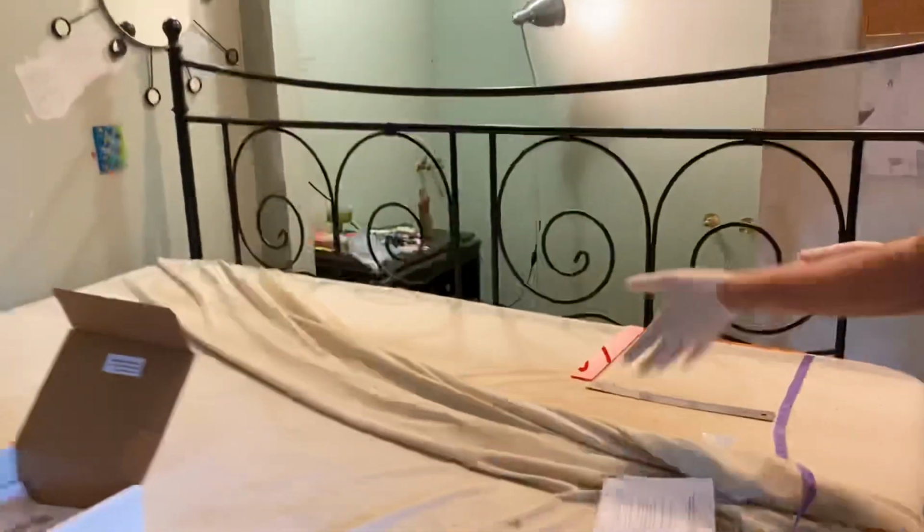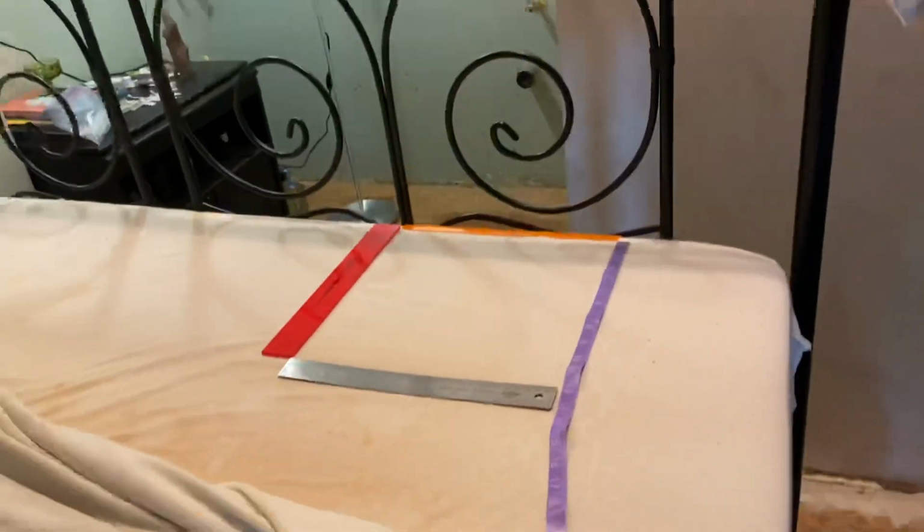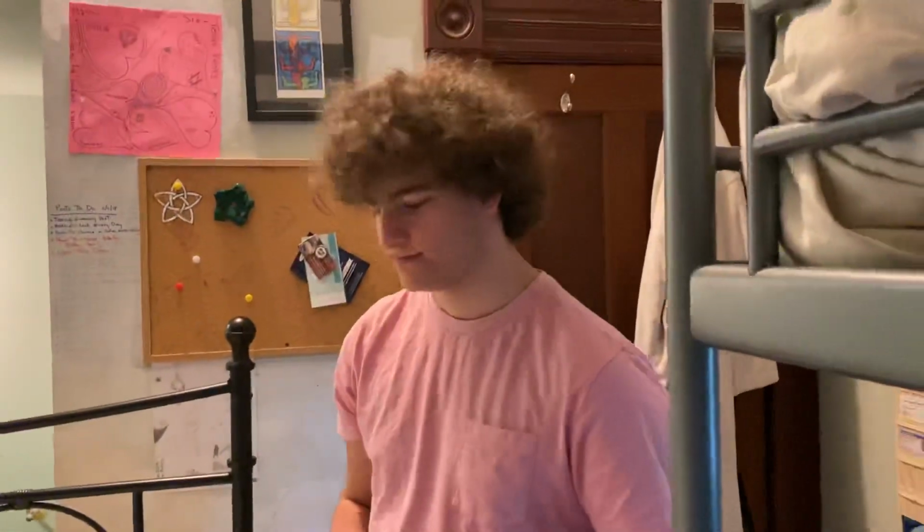the bed. And what I want to show you in a close-up is this little pilling that happens on top of the mattress. Yeah, that's pilling. And so that made me think, well, there is a chance for microparticulate lead dust to be coming up, depending on where it's coming from. So AJ just followed the instructions. He marked off. You want to tell me what you just did?